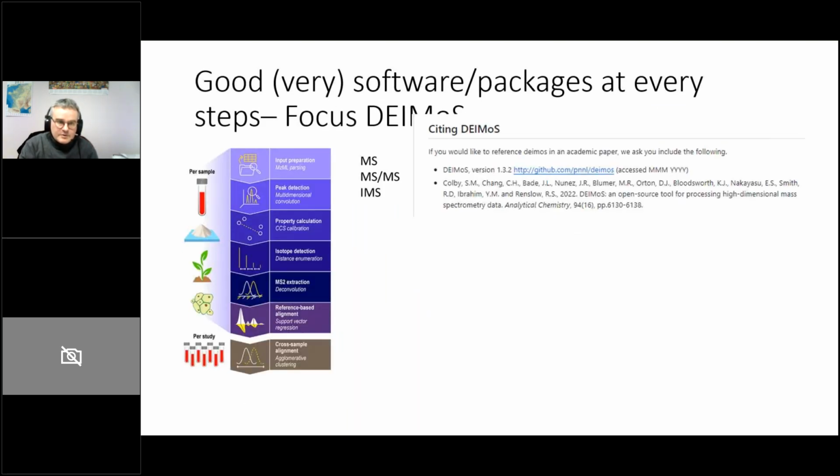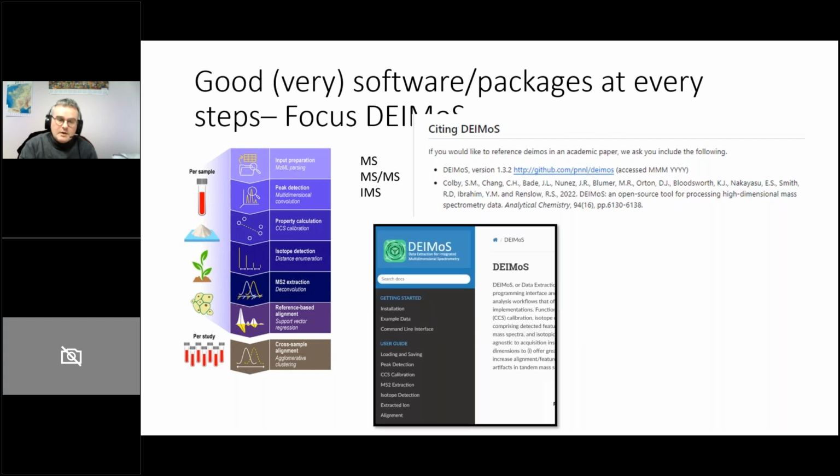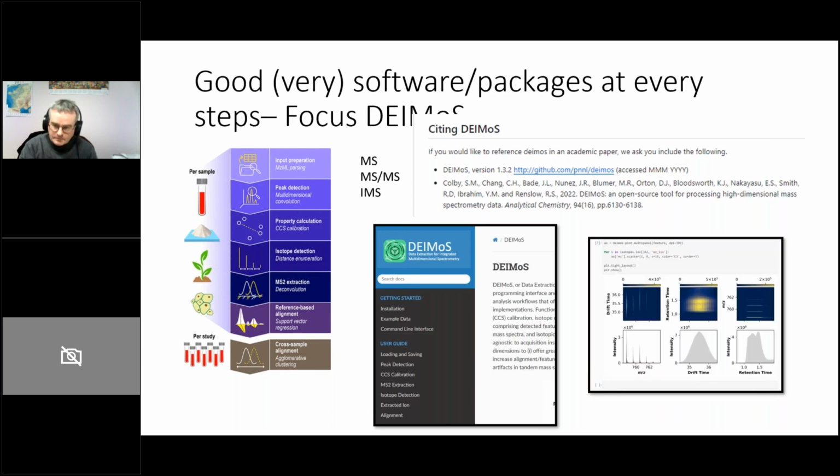So just to focus on Deimos, I think that tool is interesting, and it's an example of the new tools built today by the community of developers. Tools dedicated to our users with nice examples, nice tutorials, guidelines, examples, and test data sets. Nice visualizations also. It's not the only one to do that, and that's a good thing today with our incredible new LC-HRMS acquisition process.